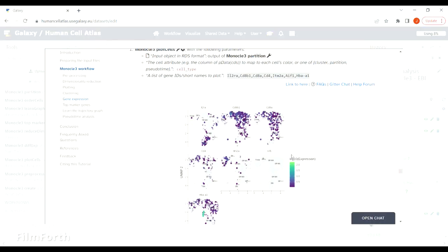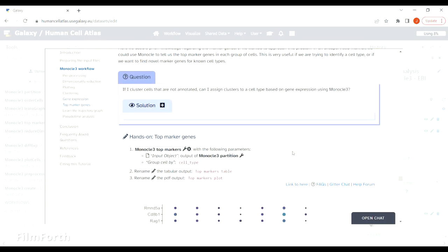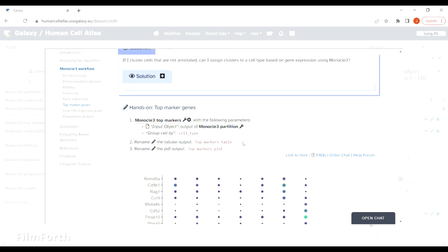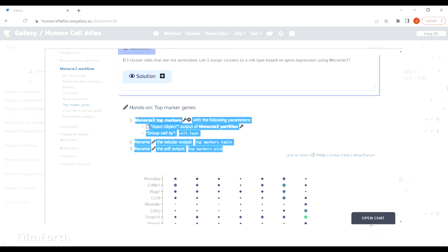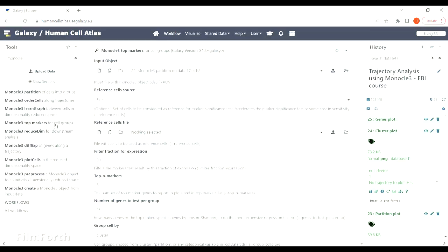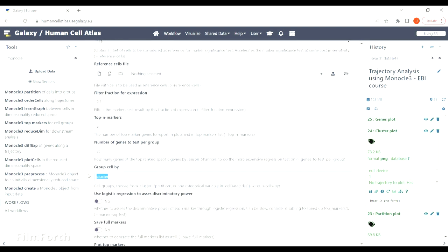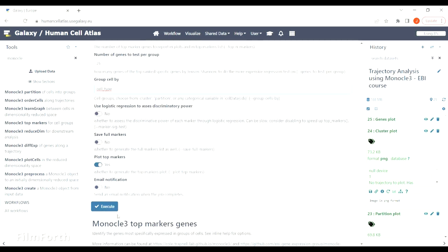Speaking about the genes, we can now use top markers tool to generate a table with the genes most expressed in particular clusters or cell types.